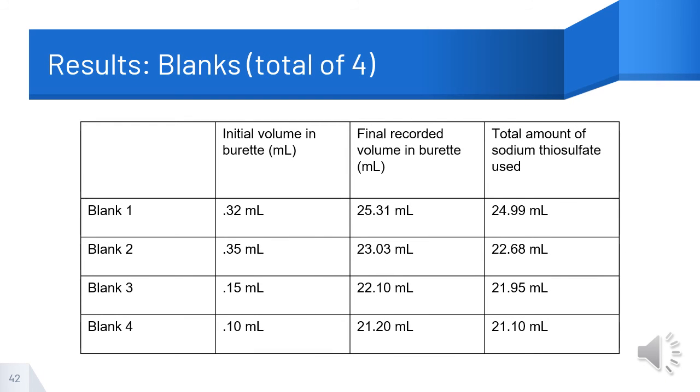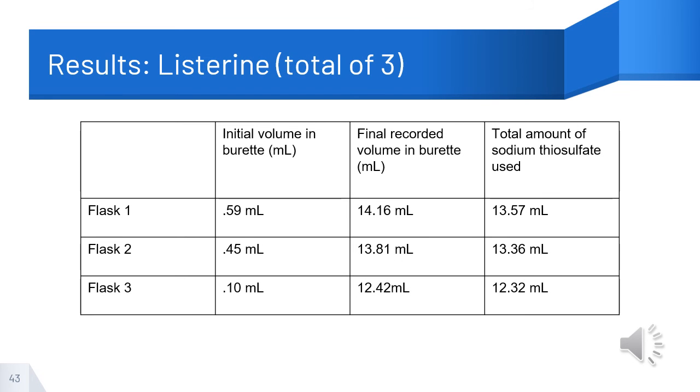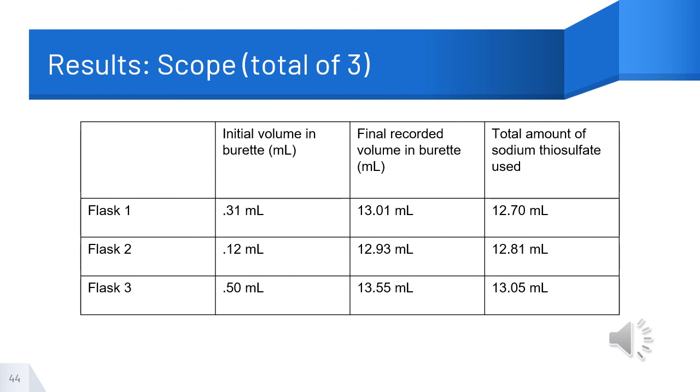This table shows the data collected from the blanks. This table shows the data and results from the Listerine samples. And lastly, this table shows the results from the Scope samples.